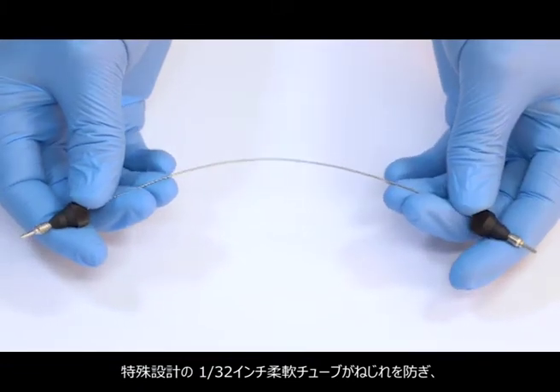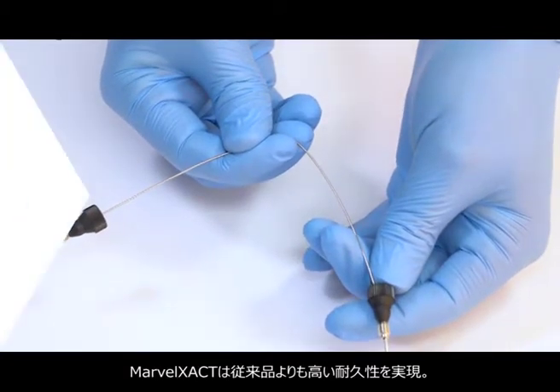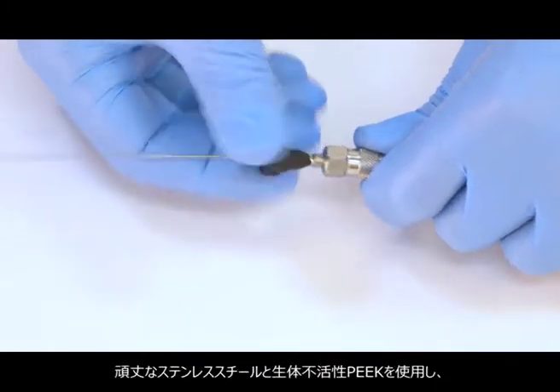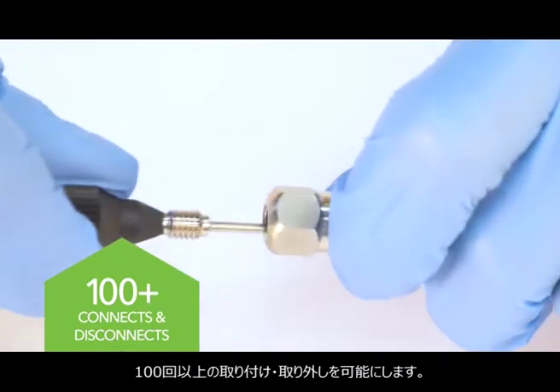It features a special 1/32nd inch flexible tubing that prevents kinking and provides easy routing. Marvel Exact has a much longer lifetime compared to conventional fittings, built with sturdy stainless steel and bio-inert PEEK. It can be connected and disconnected more than 100 times.